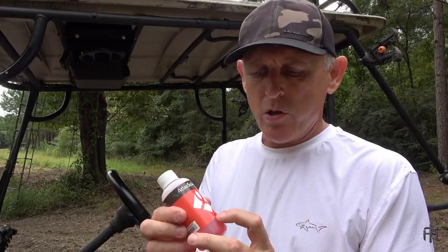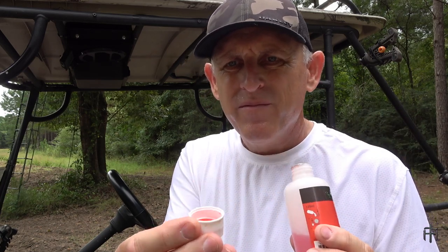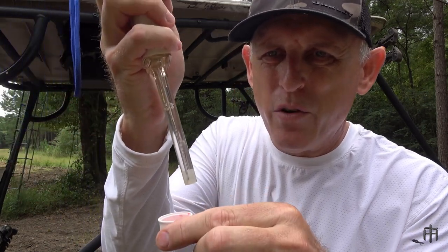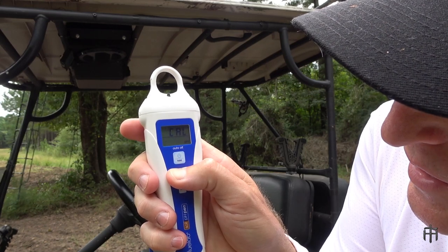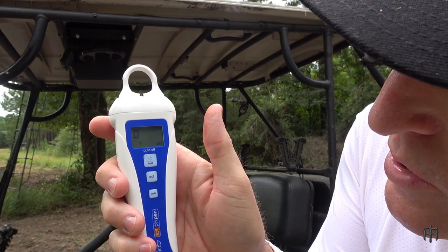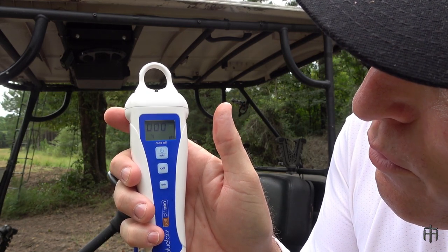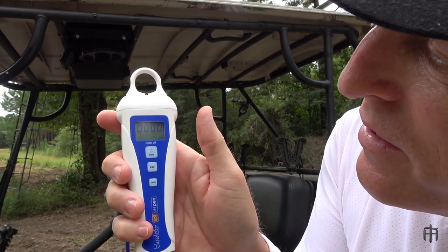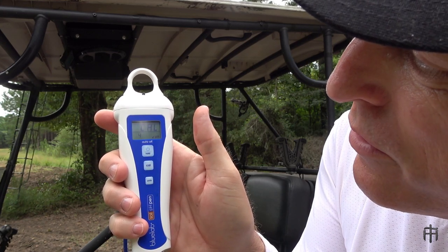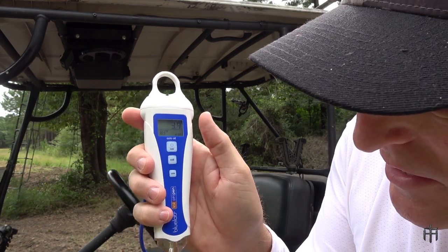Now let me show you how to calibrate this. We start with the pH 4 solution — I just pour a little bit into the cap, just enough for the probe to touch the bottom. There's a calibrate button in the middle. I stick the probe in, then press calibrate. You'll see it start blinking, then you'll get four zeros scrolling across the screen, and then it'll flash that it's calibrated for 4 — you can see the four in the bottom left-hand corner.